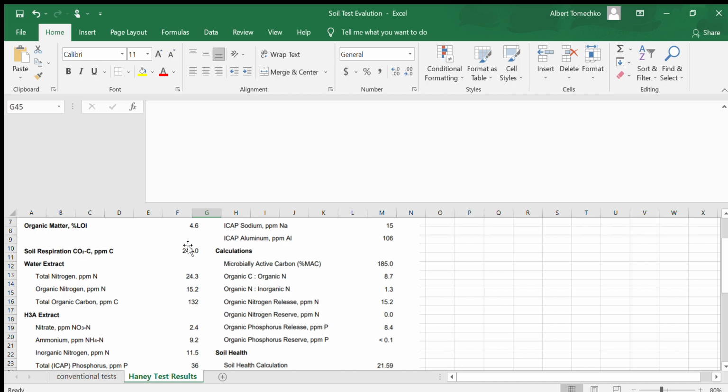Especially one of the things they recommend is using similar dates to test, and hopefully you'll get similar weather conditions because, of course, the soil's living, right? So if you have a cold spell or something like that, microbial life will slow down. If your thatch isn't as thick and you have very hot temperatures, microbial life will slow down, especially if the soil is getting overheated, etc. So there is variability there, but I was very happy to see that number.